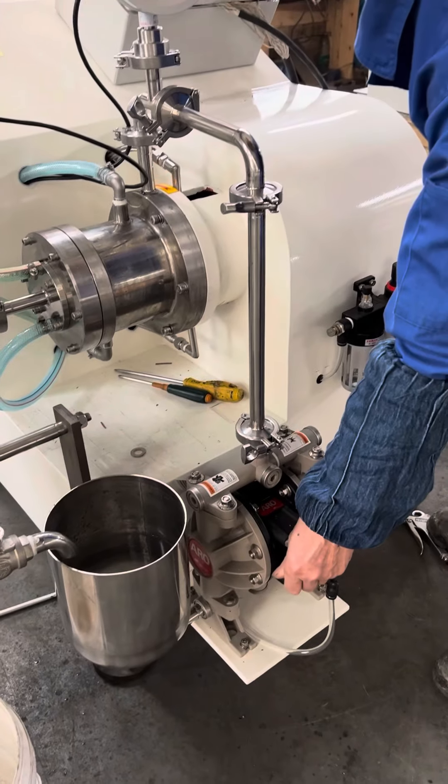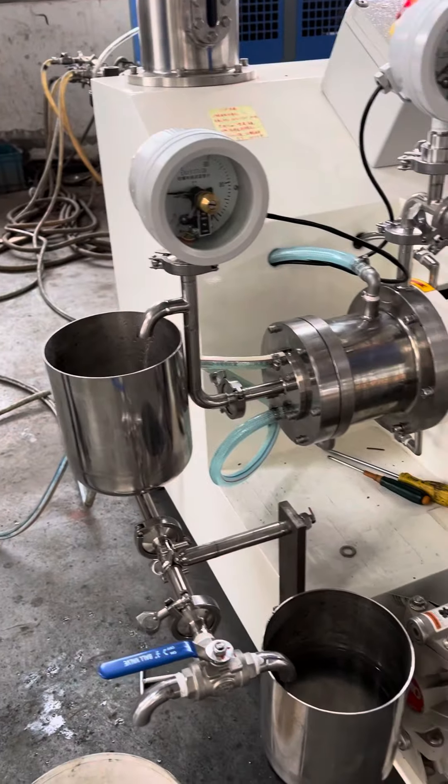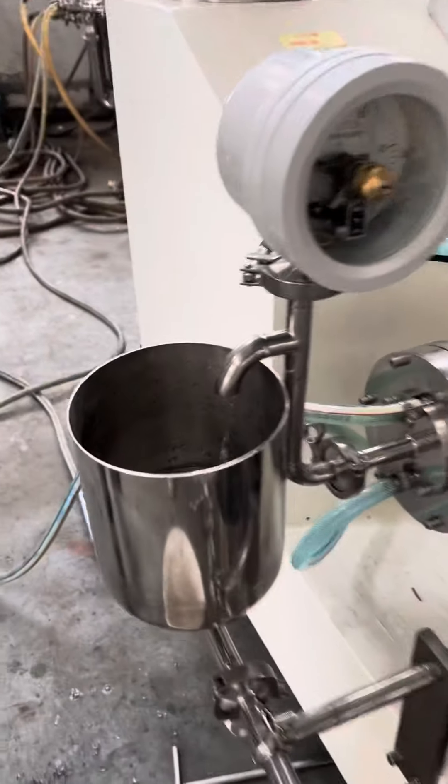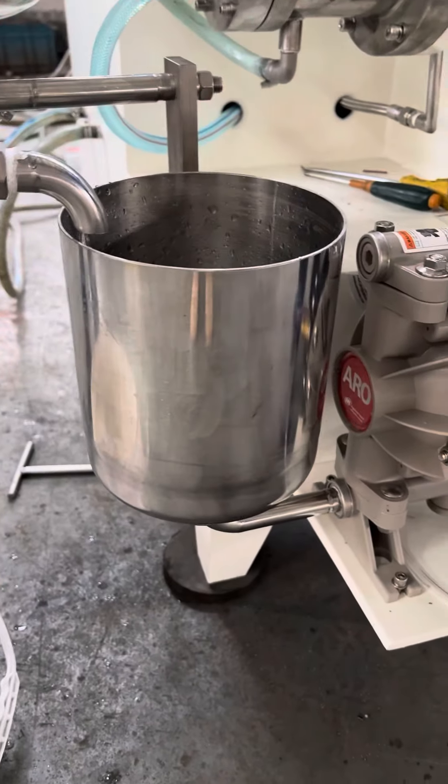Open the diaphragm pump. Start grinding. This is the receiving tank and the feeding tank.